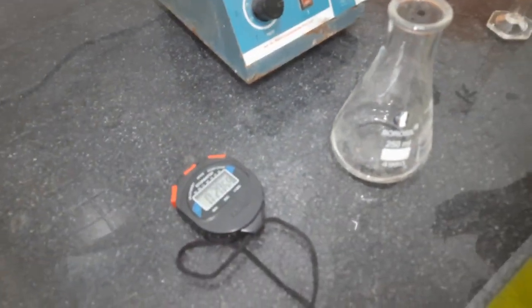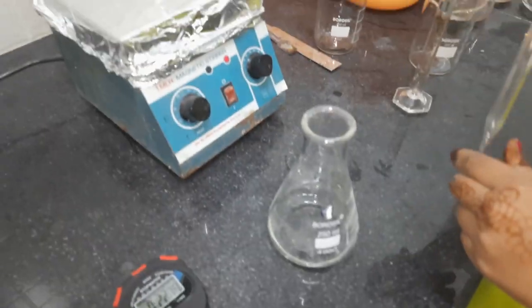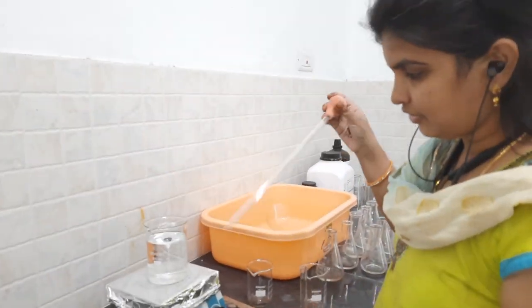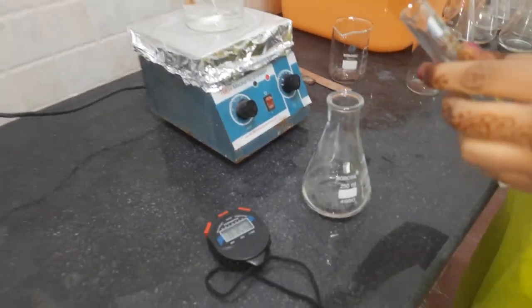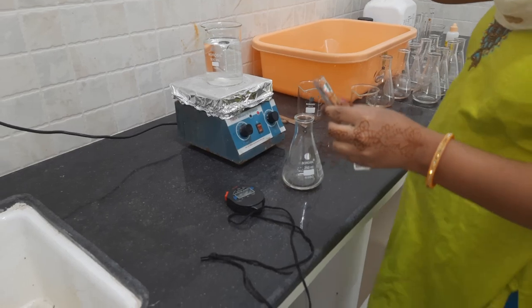So you'll be withdrawing 10 ml of solution for every minute. You tell that. Every minute I will take 10 ml, 10 ml of reactor mixture.